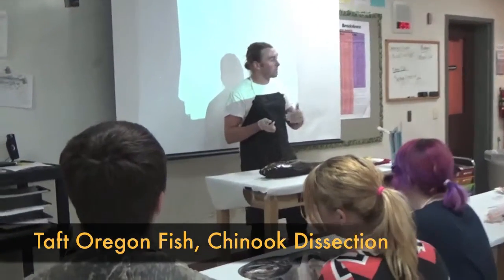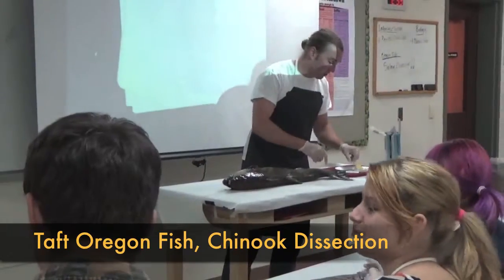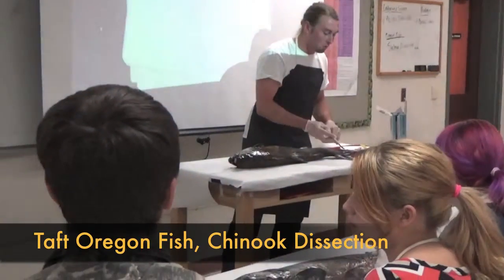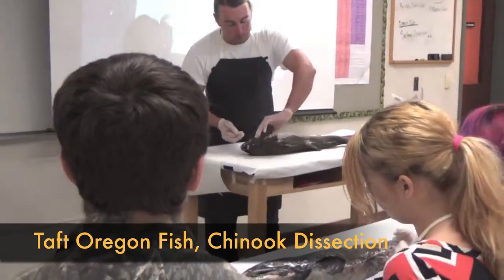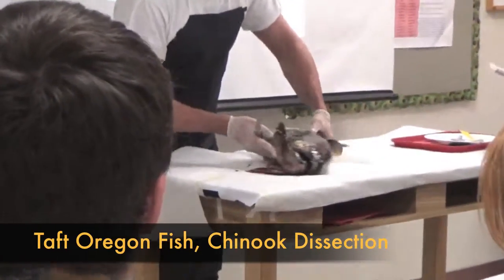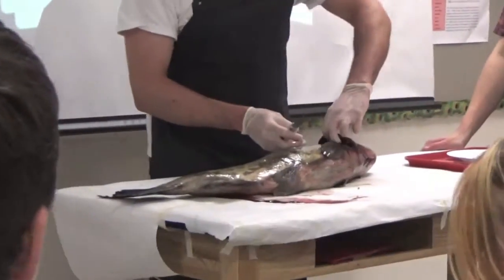Gills. We're going to work our way from the gills into the insides of the salmon. You're going to take one of your knives and you're going to open up the gills here.